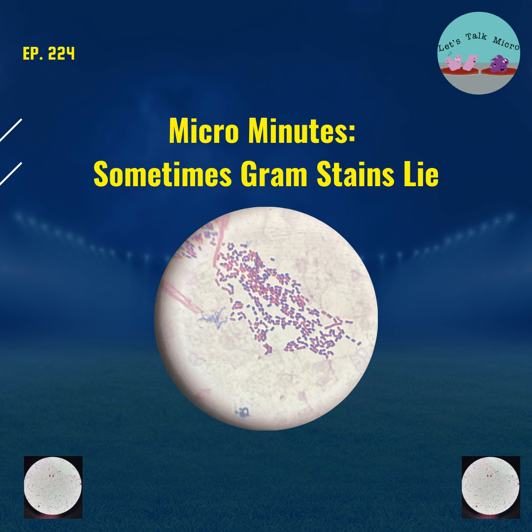That's something that you have to keep in mind when you're looking at slides. The same is true of something that is staining gram-positive, but maybe the arrangement doesn't match that of a typical gram-positive rod. You're looking at the history. So that's why I say you're looking at so many things. You're looking at the patient's history, you're looking at arrangement, morphology. So all those things you have in mind when you're looking at slides.